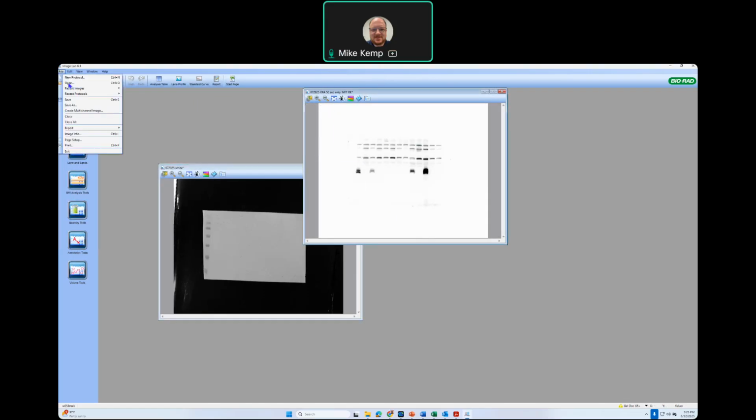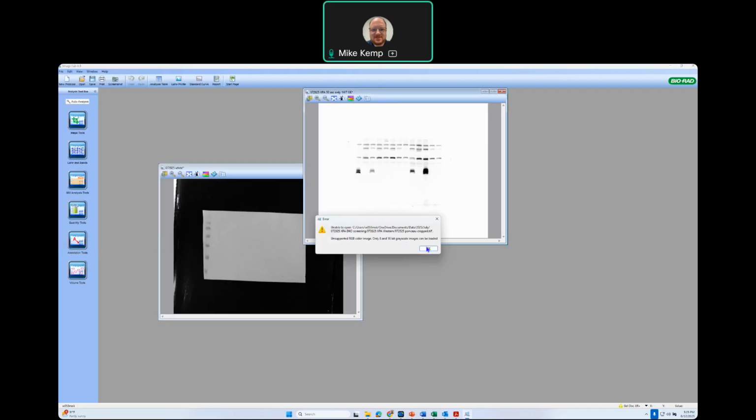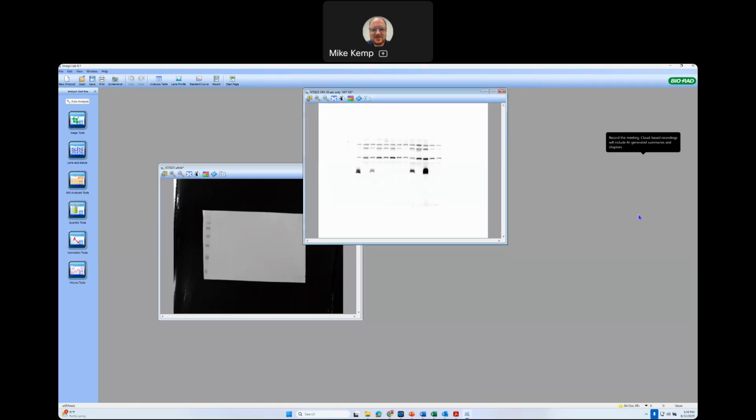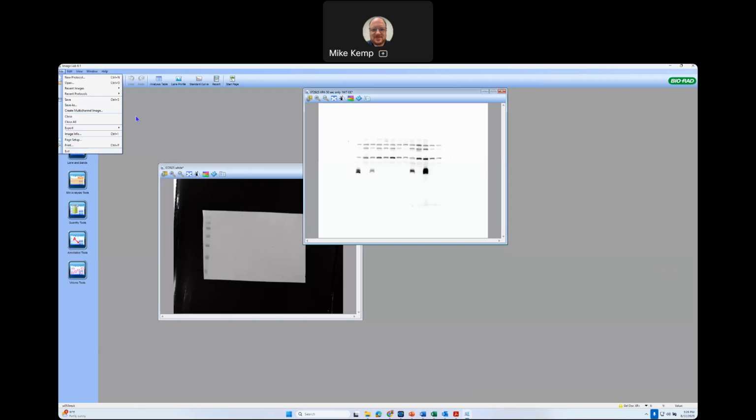Let's see, sorry about that. Let's see. So that should open. Okay. Let me pause for just a second. Okay, so I had a problem with one of the files here.